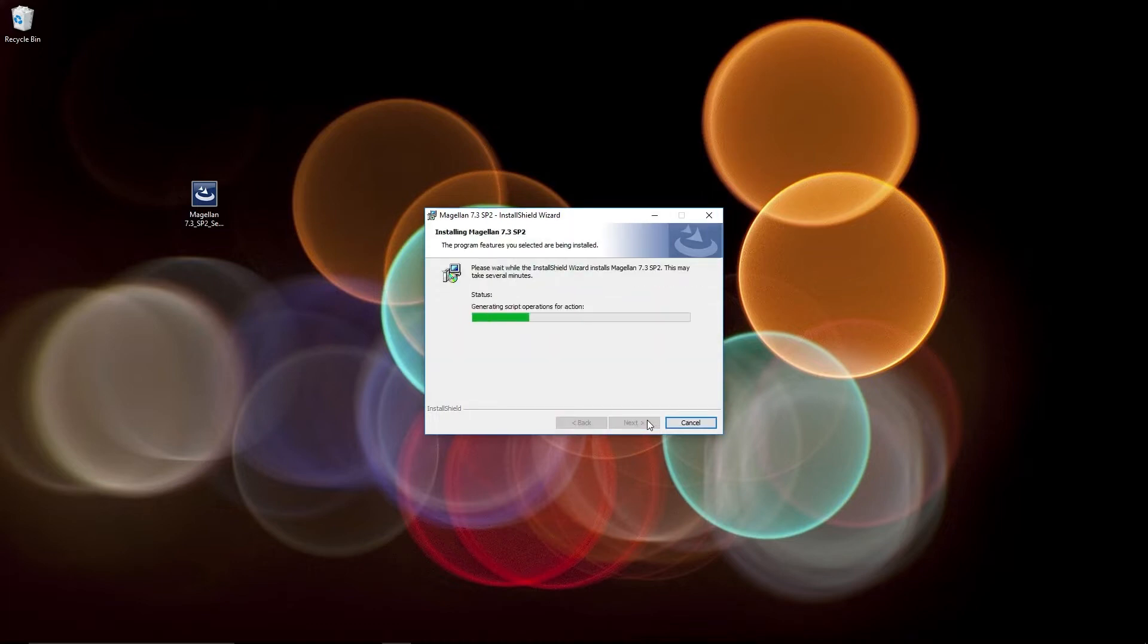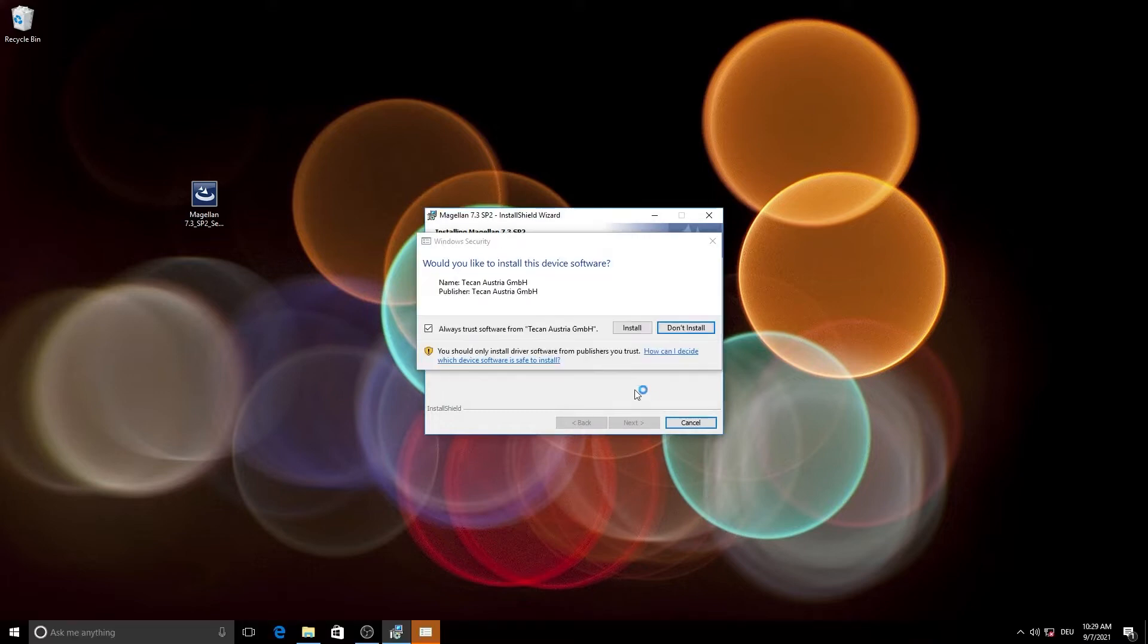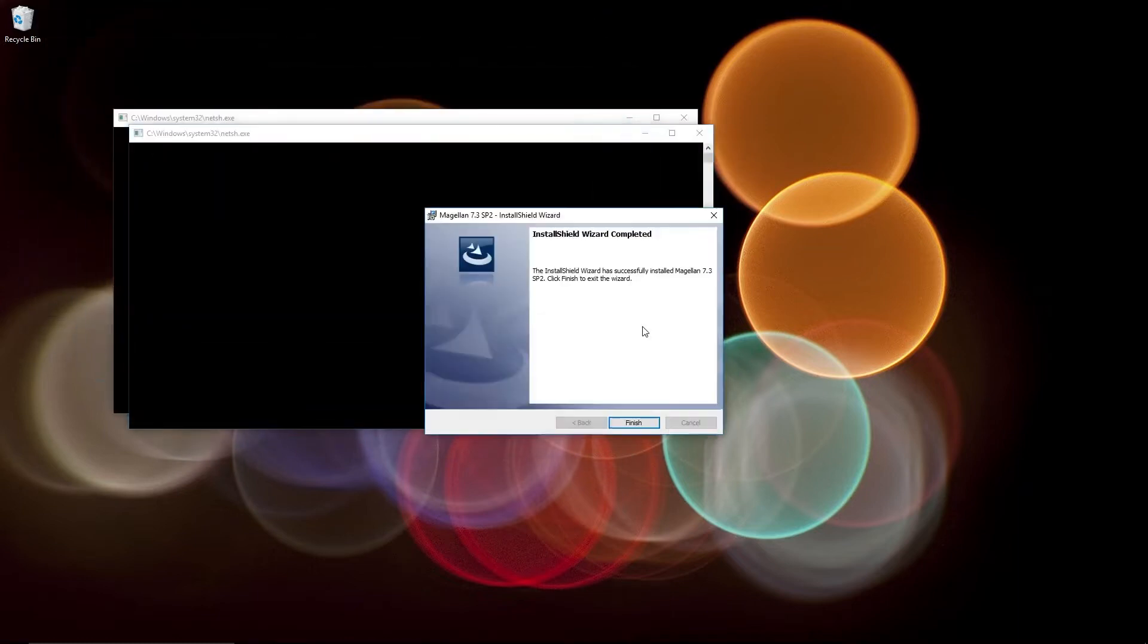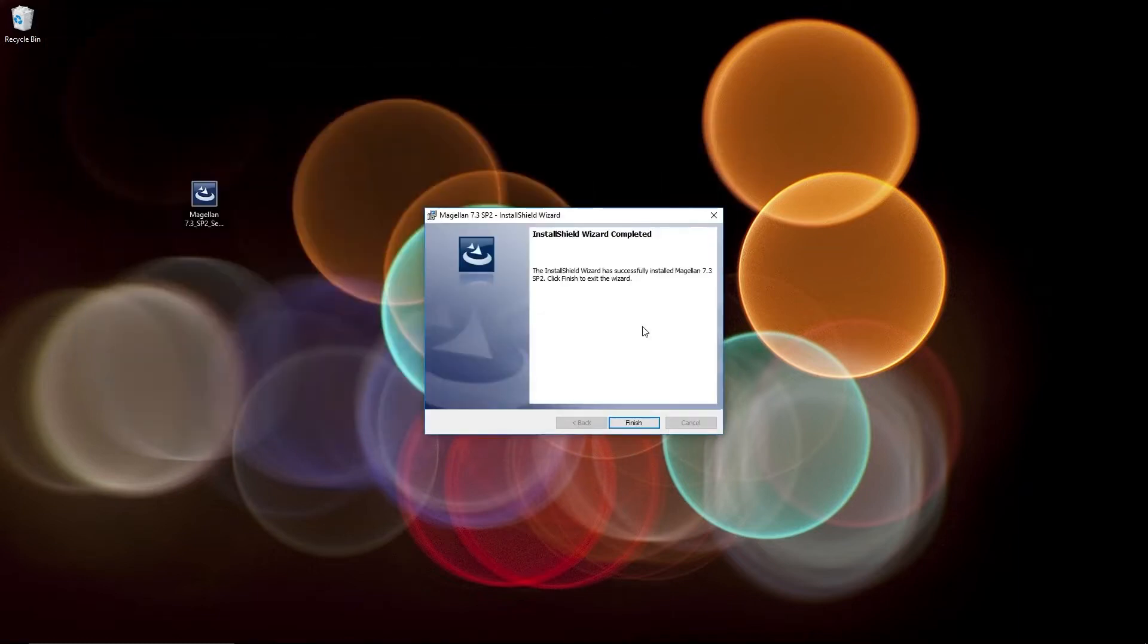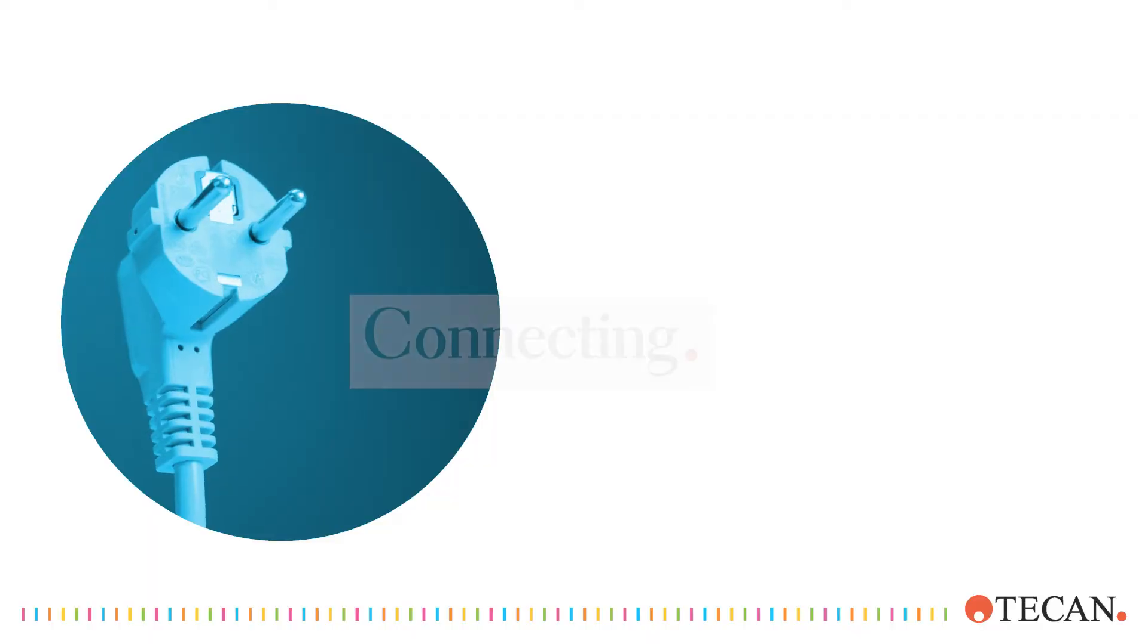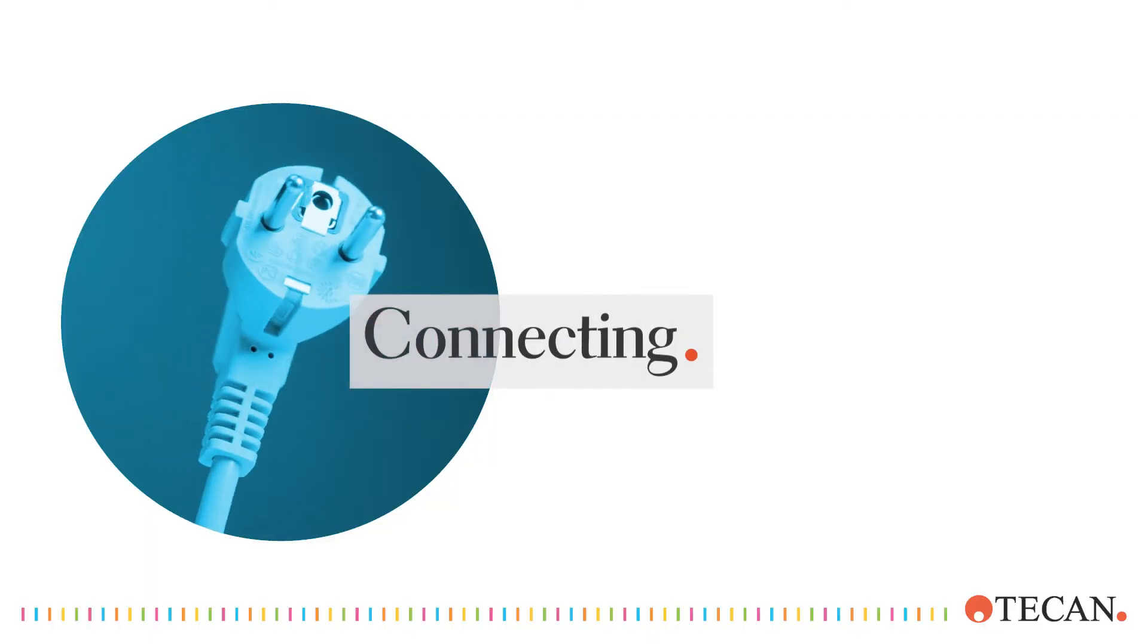Wait for the installation to finalize. Then restart your computer if necessary. Now you're ready to install the hardware.